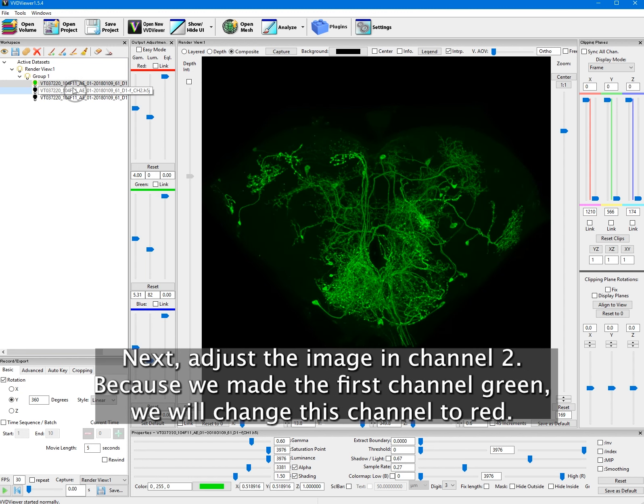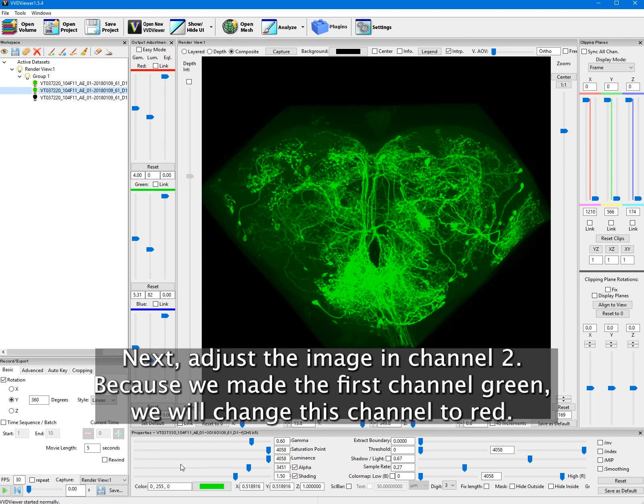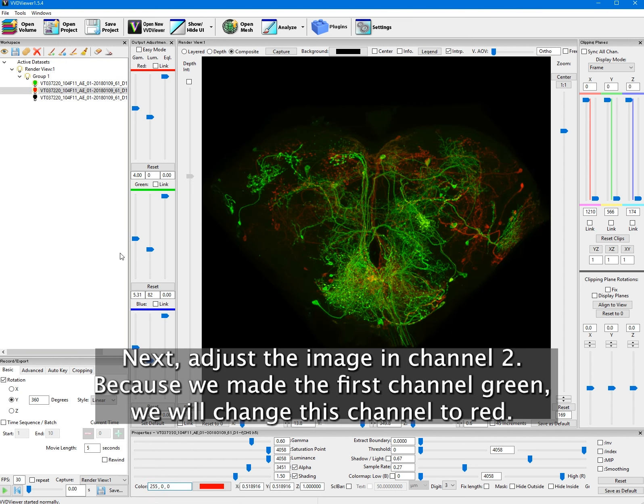Next, adjust the image in channel 2. Because we made the first channel green, we will change this channel to red.